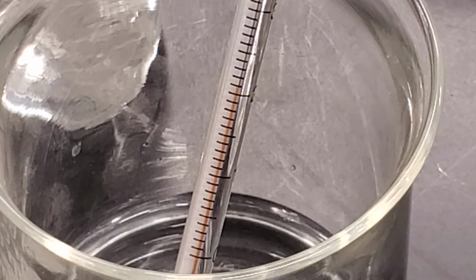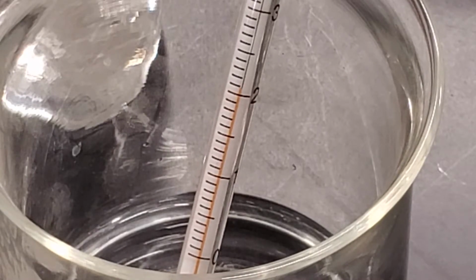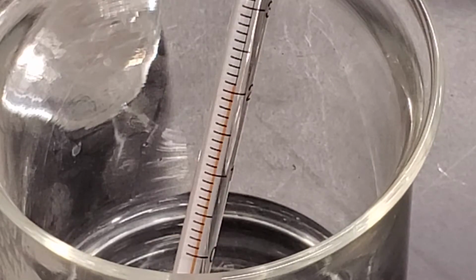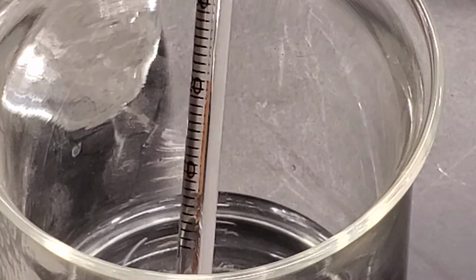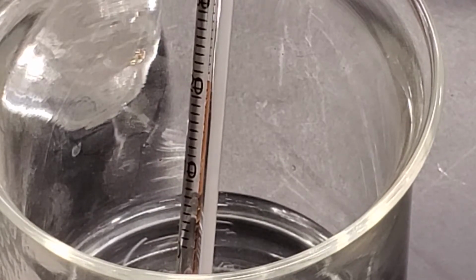And I believe we can check. I think the hash marks are every 1, 2, 3. Yeah. So that looks like it would be just 1 hash mark above the 20. So we would then record that onto our table 2 where it says vinegar, and we're going to be using the steel wool first, so we want to make sure we put it in that first blank.